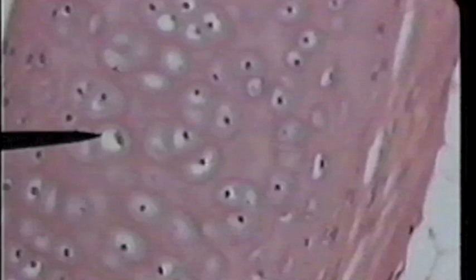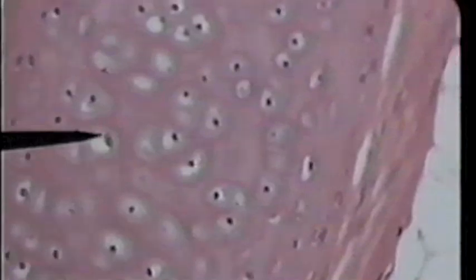However, when the tissue died, the cell shriveled within, leaving an apparent space. The tip of the pointer now is on the cell of the cartilage — the cell that has actually produced the matrix. This cell, because it's a cartilage cell, is called the chondrocyte.